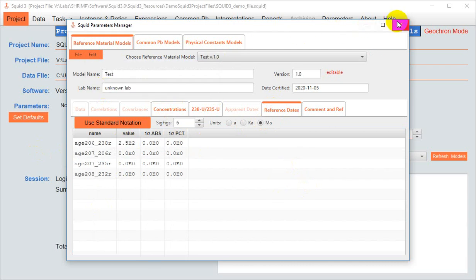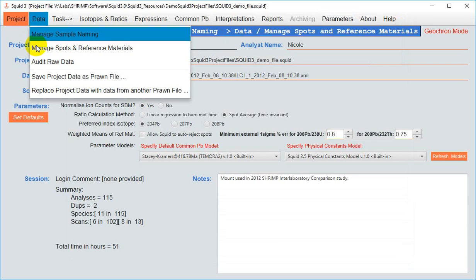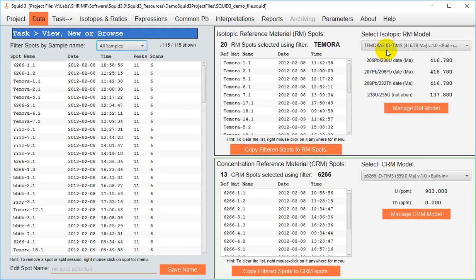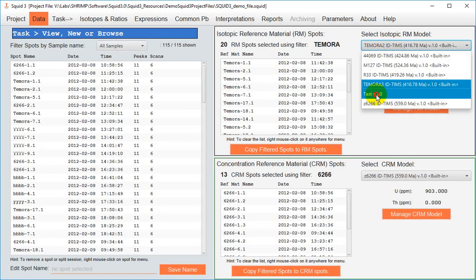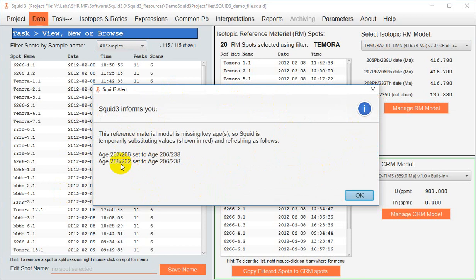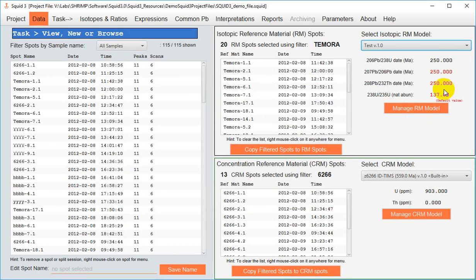Now that we've made this model, we can go back to Data, Manage Spots, Reference Materials, and it will be selected in our drop-down menu for us to choose. Now you may have noted there that I only put in the 638 age. SQUID3 informs us that it's making some assumptions about what that means for the 7-6 and 8-32 ages. And you'll see it's assuming they're the same, and any assumptions that it makes shows up in red font here.